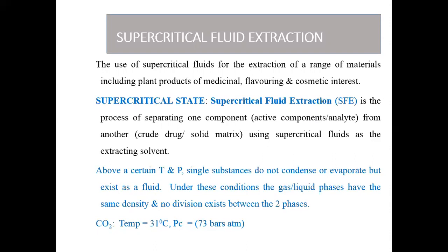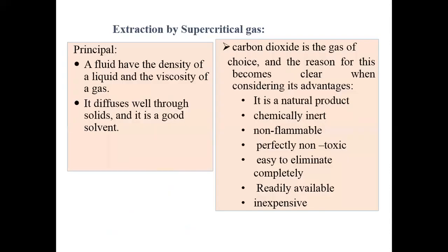So, CO2 at a specific temperature and pressure gets converted into a supercritical fluid, and that fluid is used as a solvent for extraction purposes. Principle of SFE: the fluid has the density of a liquid and the viscosity of a gas. The supercritical fluid diffuses well through a solid and is a good solvent for extraction purposes.